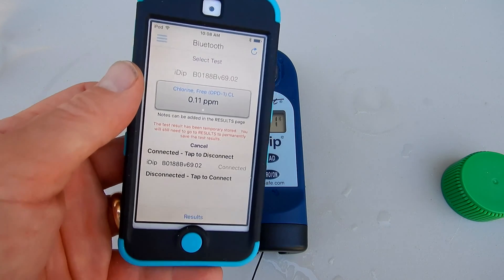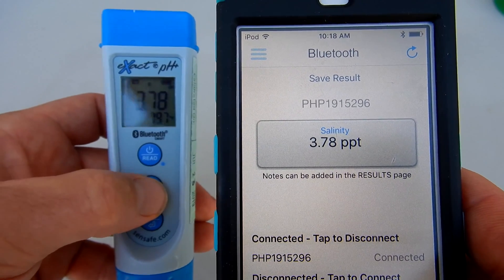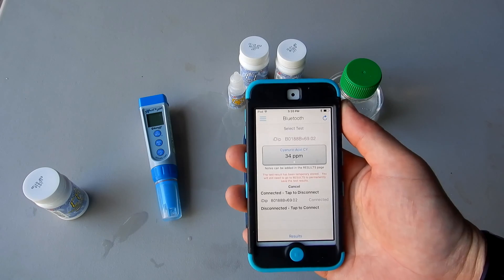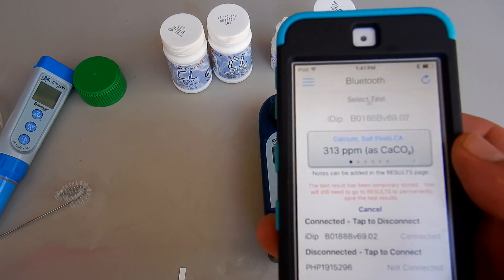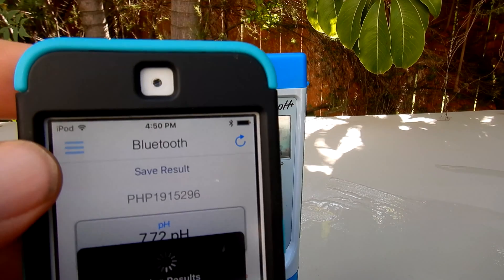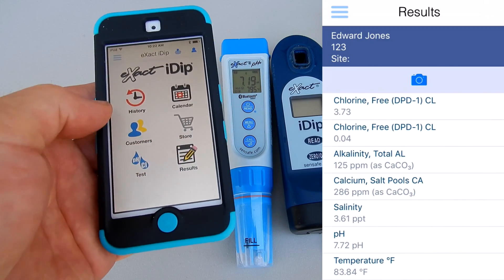I did multiple testing with the Exact iDip and with the pH Plus meter, and I matched the results against my other digital testers and photometers. I found the results of the Exact iDip and the pH Plus to be very accurate. I really like all the particular test factors you can do with the Pro Kit. You can order more test strips and install more test factors into the app to test for copper, phosphates, nitrates, and many other things necessary for the pool and spa industry. I think the Pro Kit would be a great choice for professional pool and spa water testing.